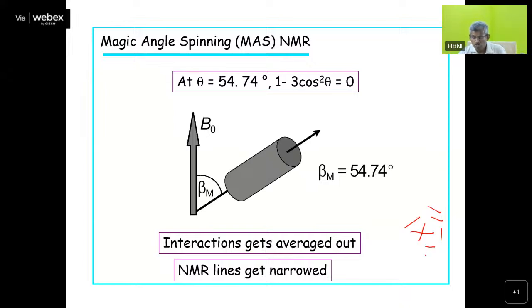So we have all sorts of orientation possible in the case of a powder sample. It's randomly oriented, nobody can prevent it, nobody has a preferential orientation. So a powder material is there in that cylinder. And then I keep it at an angle of 54.74 degrees.